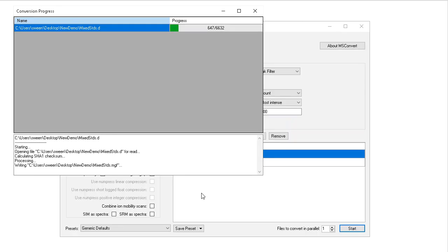The outputs are going to be in a text format with masses and then a tab and intensities. Although we're separating the full scan data here from the MS-MS data, they're closely linked by the exact time at which these spectra were taken.